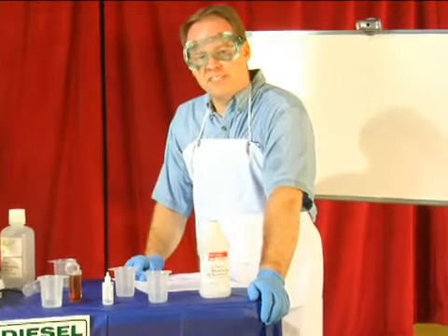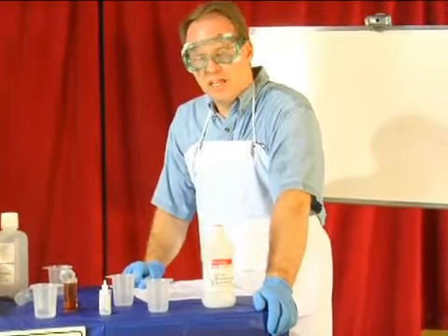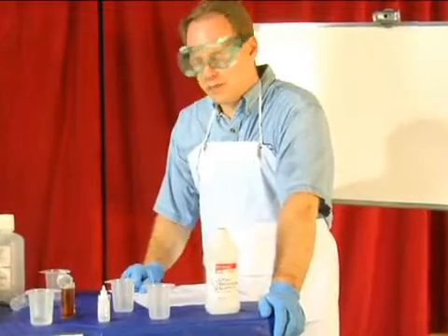My name is Graydon Blair from Utah Biodiesel Supply, and on behalf of Expert Village, I'm going to teach you how to do a basic titration on your oil.